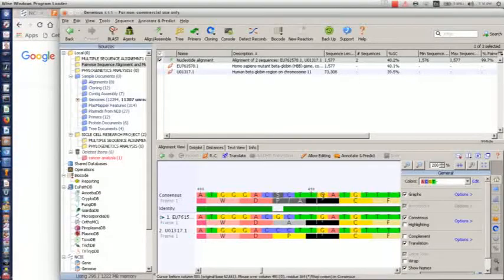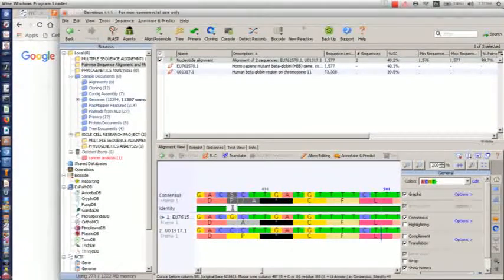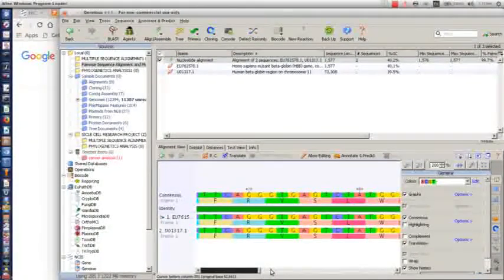So the function of proline was replaced with alanine. You understand? Replaced with alanine. Are you getting it now? It was replaced with alanine. So now this consistency is just telling me it's either protein or alanine, but we understand that what's supposed to be here was what? Proline, but replaced with what? Alanine here. So that's why there's alteration here. So let's just keep going.